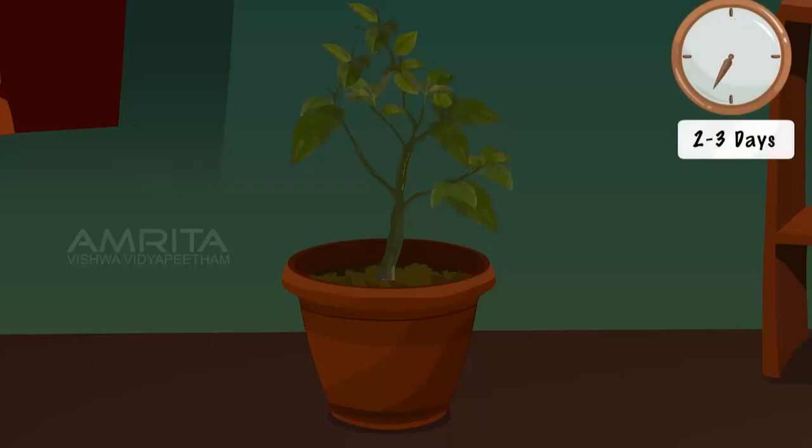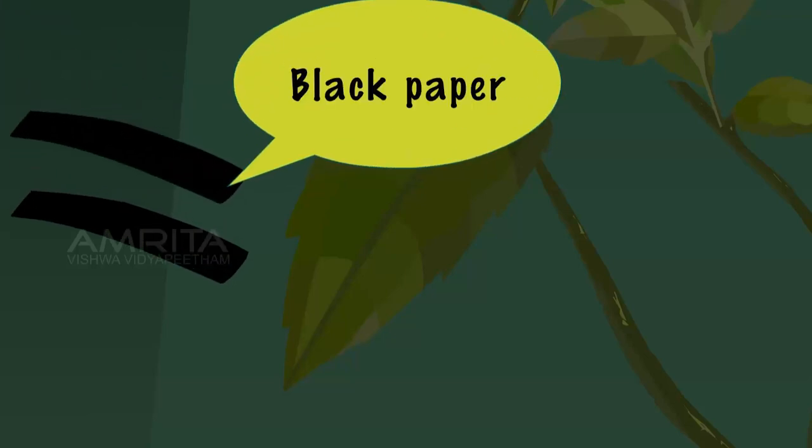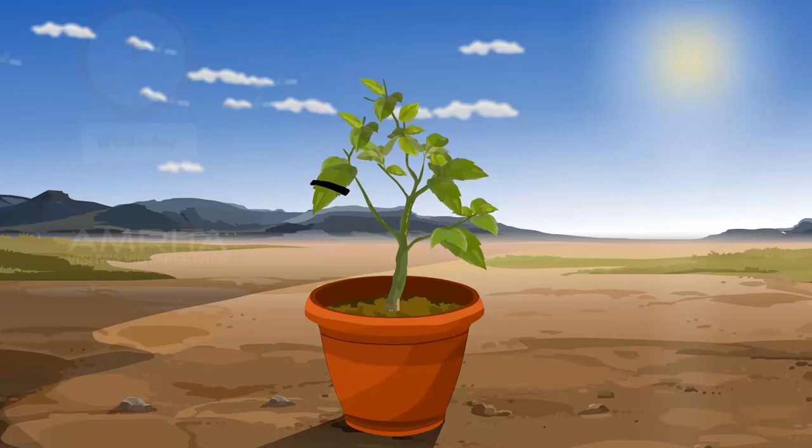Take a healthy potted plant and keep it for 2-3 days in a dark place. Take two uniform pieces of black paper. Select a healthy destarched leaf and cover a portion of the leaf on both sides using these two uniform pieces of black paper. Now, place the potted plant in sunlight for the whole day.